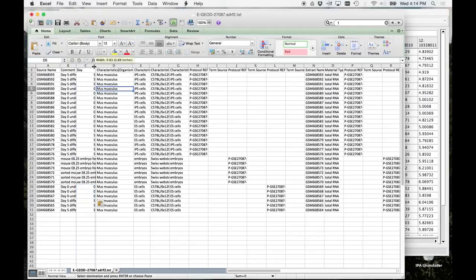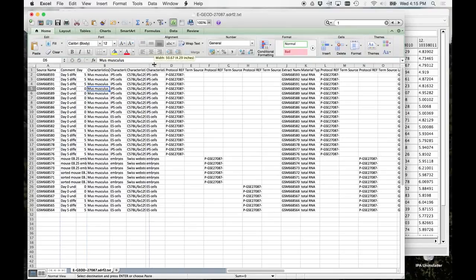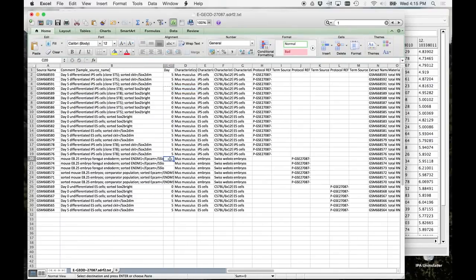There is a lot of cutting and pasting in bioinformatics. I'm just going to warn you right now. I'm going to expand this once I'm done. Some of these don't have anything. I'm going to tell you right now, Partek does not like blank squares. It freaks out, like, what's in there? Basically, what they wanted to do is take a bunch of mouse embryonic stem cells or cells from the endoderm and compare them to the differentiated state. Those don't really have a date, so put a question mark.